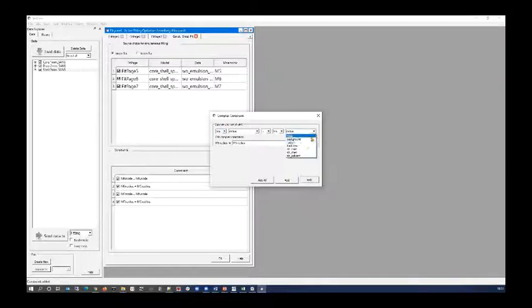And I'm going to do the same for the shell thickness. So I've now got 6 constraints. I'm going to ask the program to optimize this model to find one solution that will fit the 3 different contrasts, but with the same volume fraction, the same radii, and the same shell thickness. So I'm just going to close this down.